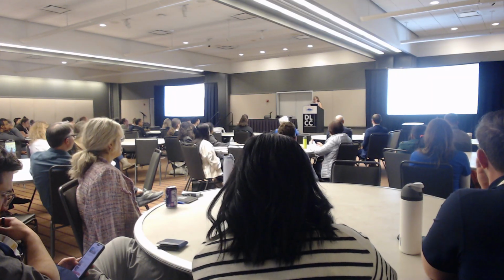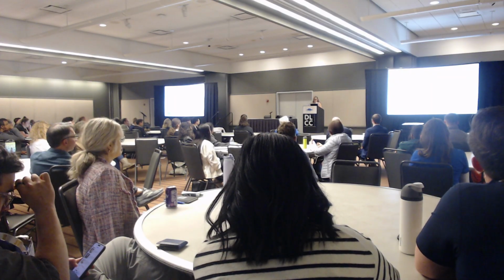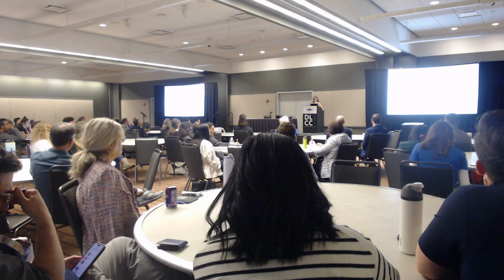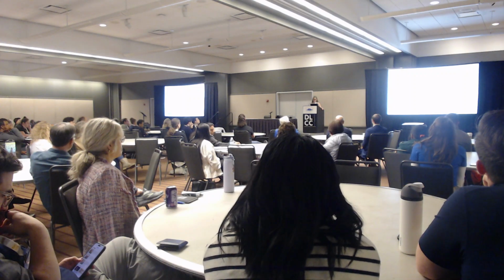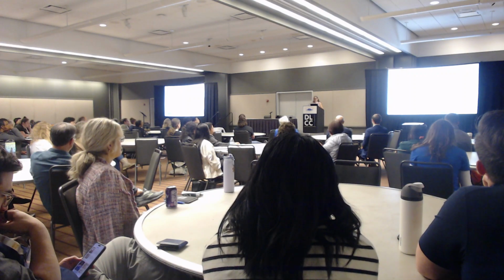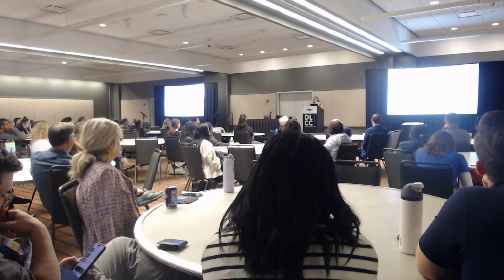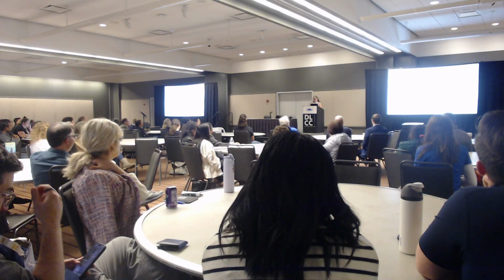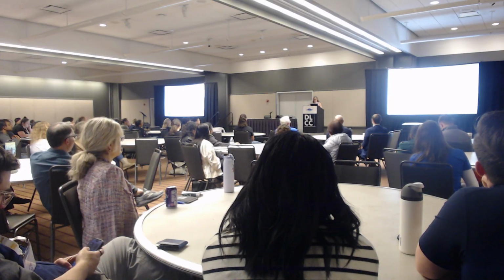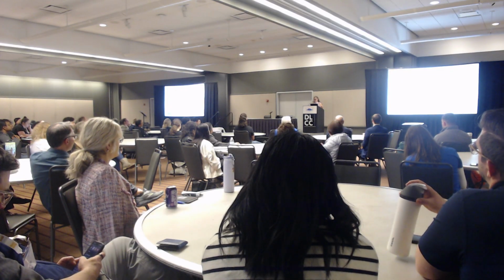When I see an assay and I know some investigators that I've prepared samples for on different assays, or methylation or other types of modalities, I can reach out to them. Now, adaptive is a lower risk because we know the investigators who are going to be interested in it. We can survey and look at what's available. A lot of times there's a couple of kits that we can try. It can be iterative, collaborative as well with the investigators.